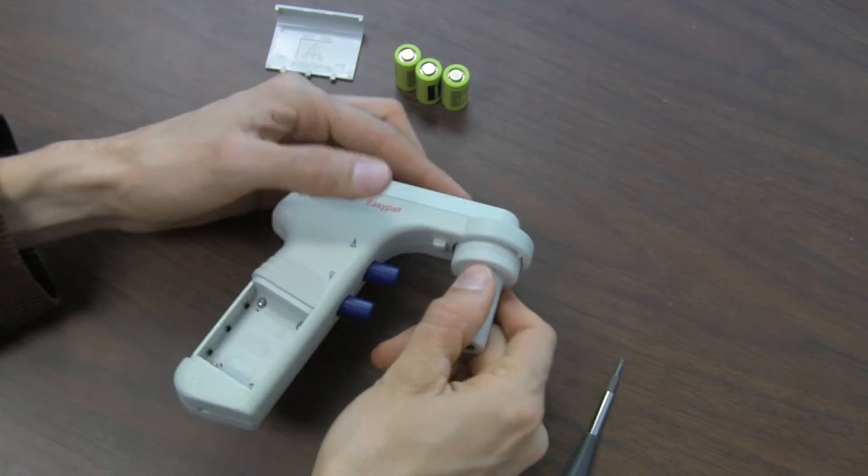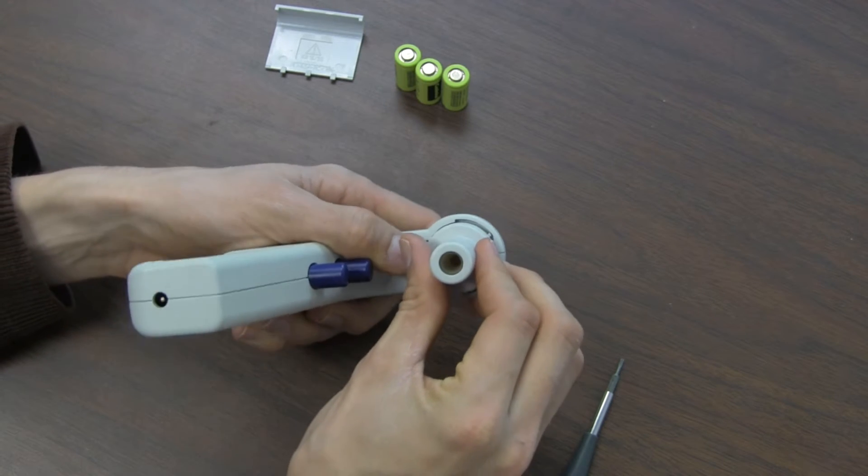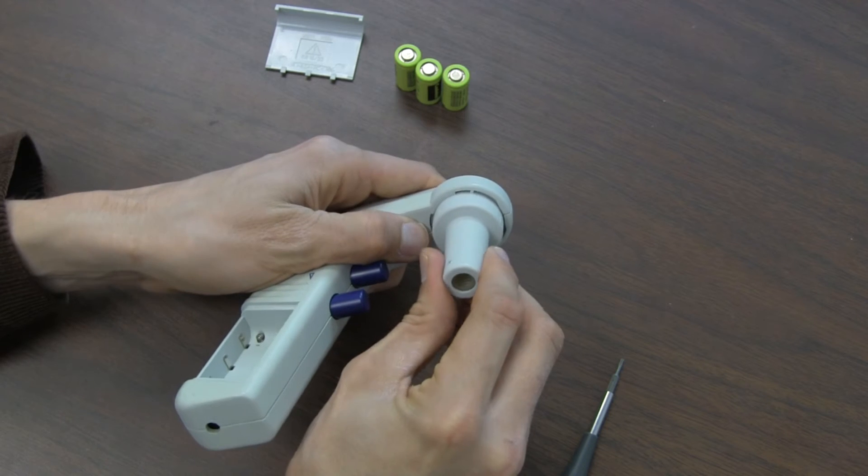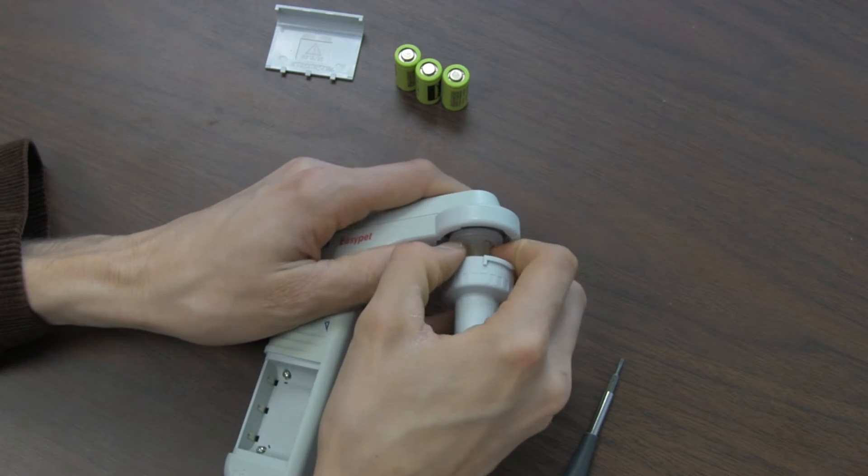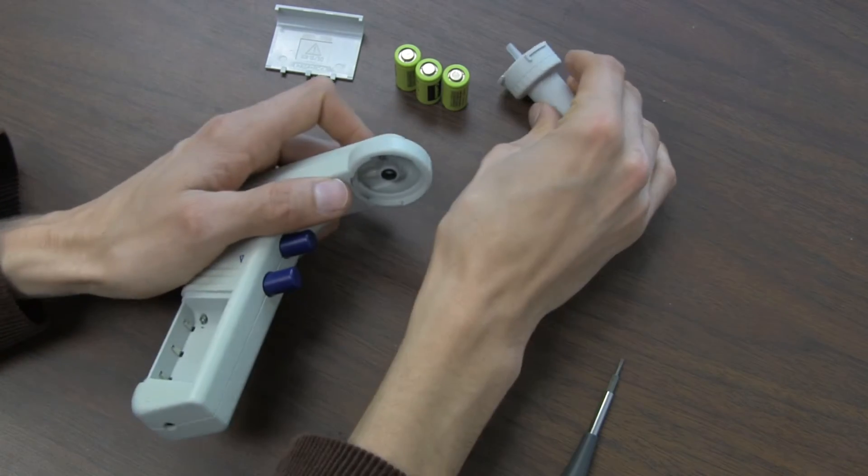And these are not the only screws that need to be removed. There's also some under the head here. So to remove the nozzle, you push down this button right here and then turn counter-clockwise and pull out the nozzle. Set that aside.